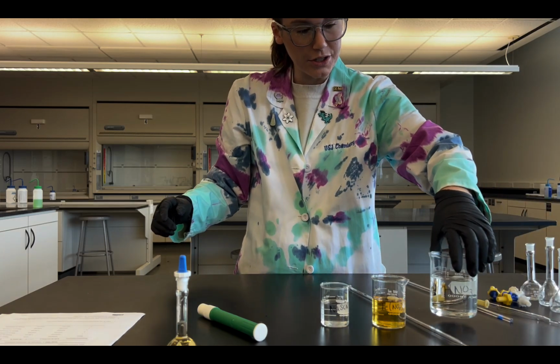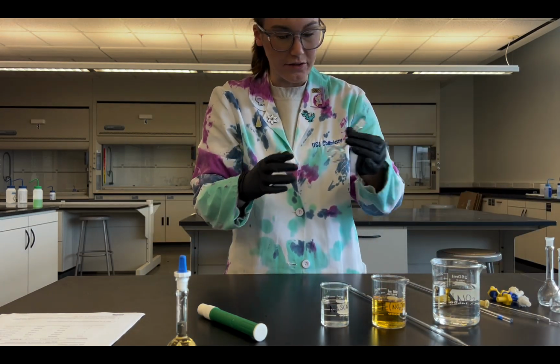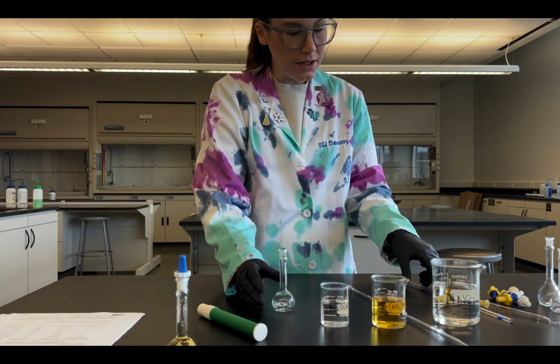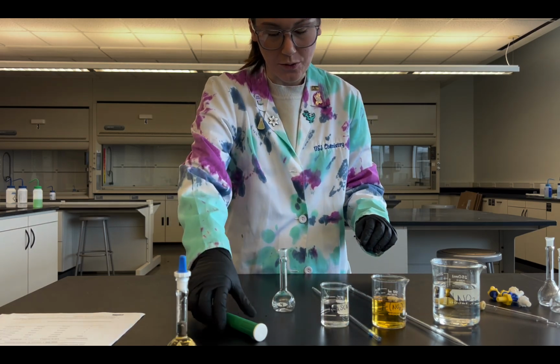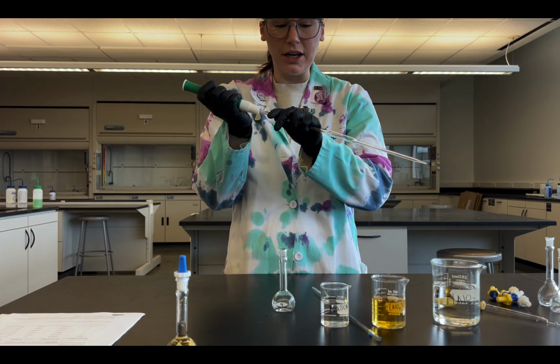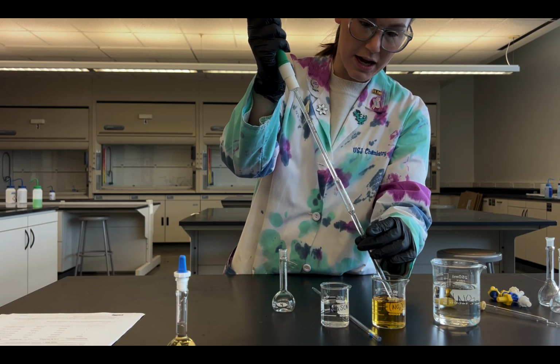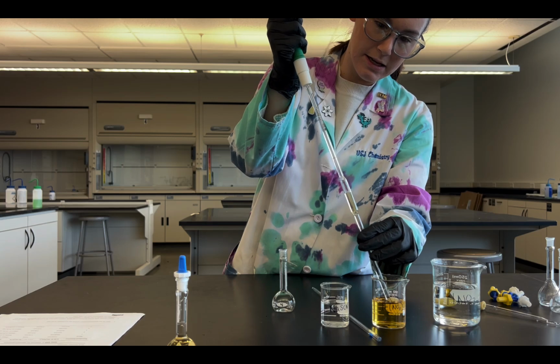Next, we are going to do test tube number 1, which, as we saw from the beginning of our pre-lab lecture, is going to be 10 milliliters of the iron nitrate, 1 milliliter of the sodium thiocyanate, and then we will fill the rest of the way with the nitric acid. So I'm gonna follow a similar procedure where I'm gonna do my 10 milliliters of my iron nitrate. So I'll do this twice.